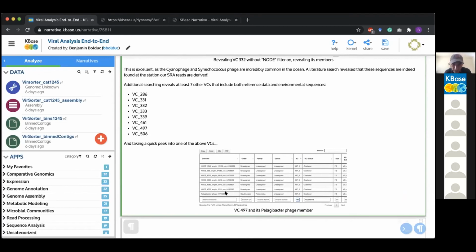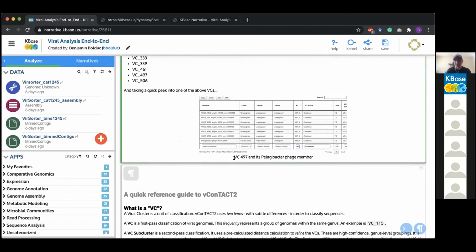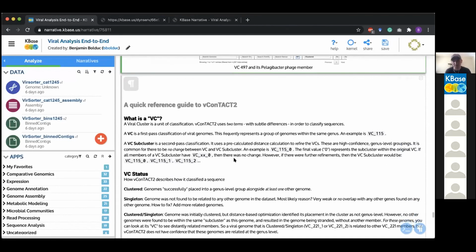And we apparently have a cluster that has 37 KB, 5 KBs. These are probably fragments, 12 KB, 37 is probably still. And you can explore and do other things that you would like with those genomes.